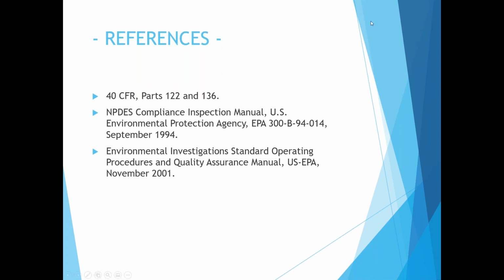Okay, Cornell, I have another question. What document would state that VOCs cannot be collected using a sampler pump into the VOC container as a grab? So again, if you look at standard methods, it doesn't say that it cannot be collected using a pump. I don't believe it says that specifically. However, it says that it needs to be collected in the container. It'll be analyzed with 0 headspace. And those containers do have preservative in them, so you have to be really careful about it.